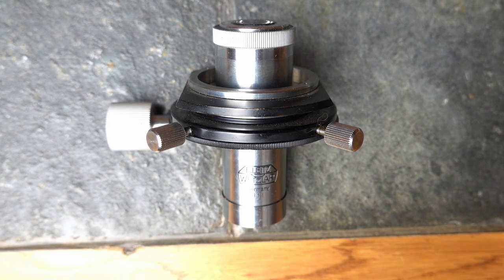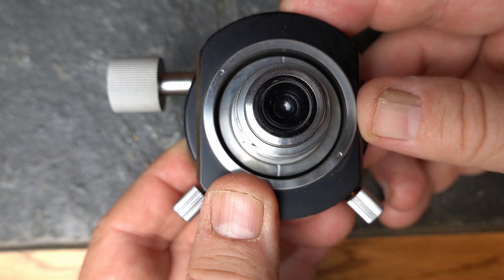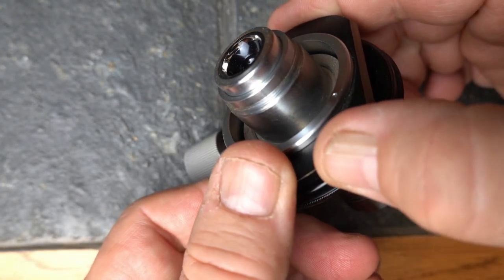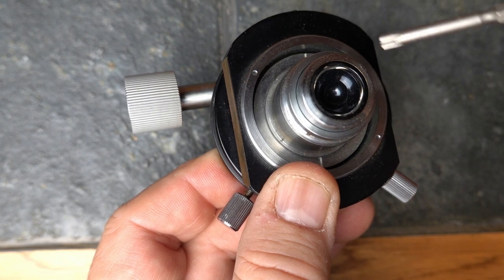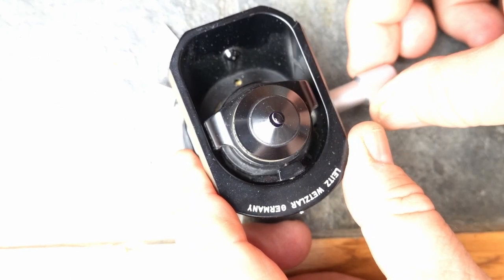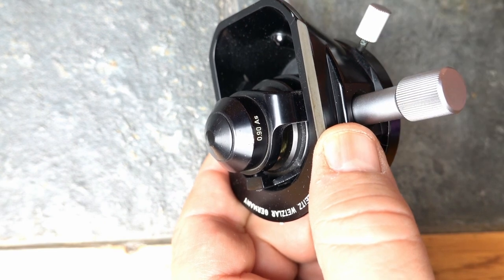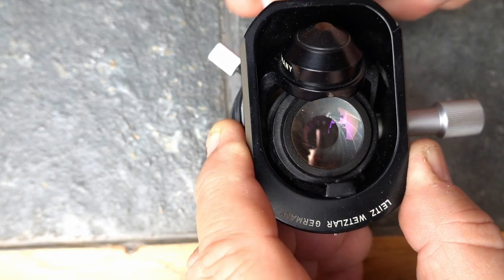You don't get true bright field with the Heine condenser — with brightfield objectives you get circular oblique, just a thin ring of light. For dark field you simply make the NA of the ring larger than the NA of the objective. So it does circular oblique, phase contrast, and dark field — it's a do-it-all condenser with a really clever design. The part of the condenser closest to the slide is extremely concave, and right around the edge is a thin annulus where the ring of light comes out.